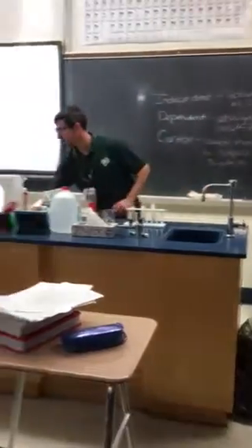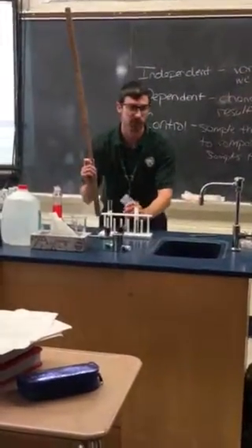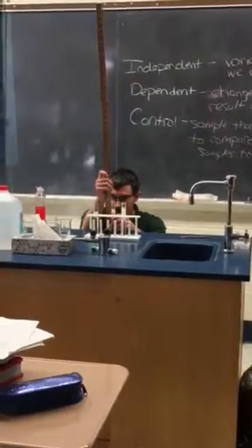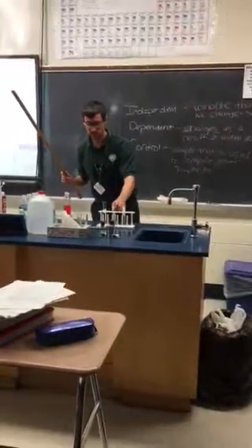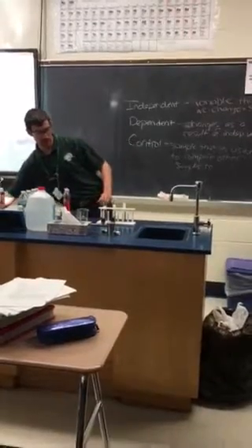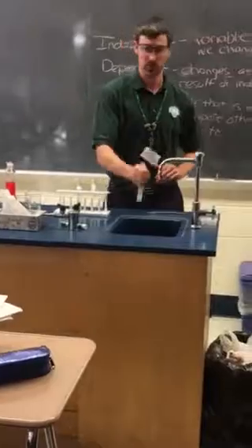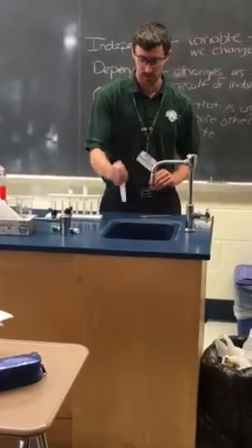And again, we measure. And so you should be making predictions as to what you think will happen. That's your hypothesis. So this is 3 centimeters. So you can already see the difference in height of the suds, right? This one is pretty near the top. And your third one, you should give it a good shake. And since it is only water, it's okay if it spills a little, but we just have to clean it up.